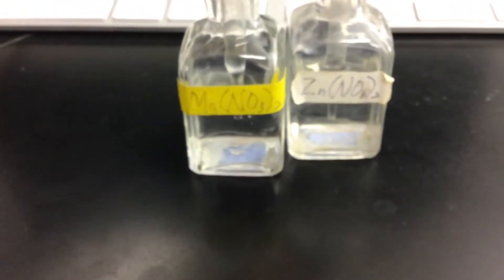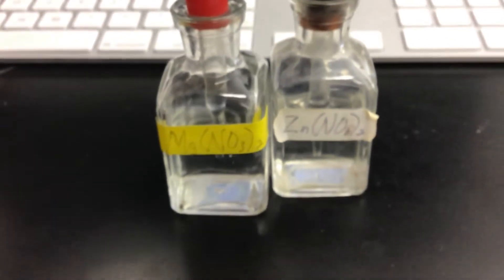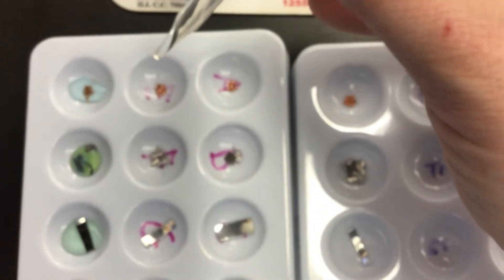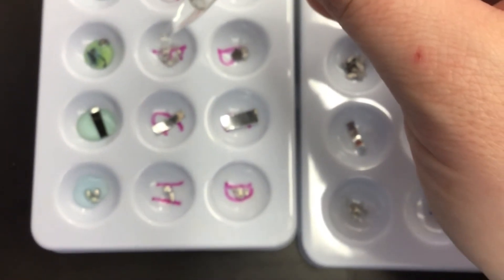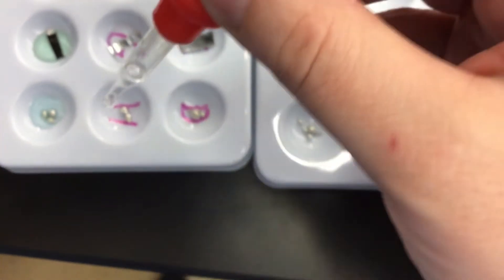Next we're going to do magnesium nitrate and put just a couple of drops with each of our four metals, just like before. Starting with the copper, a couple drops there, a couple drops with the magnesium, a couple drops with the zinc, and a couple drops with the tin.